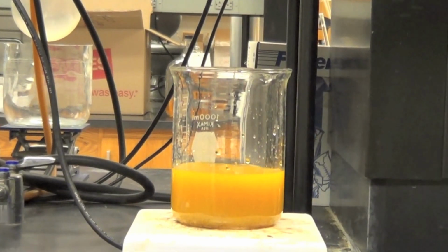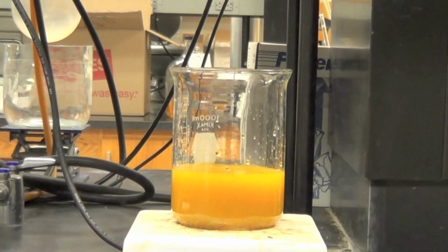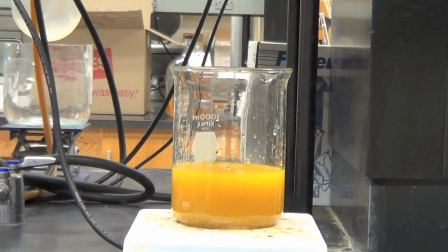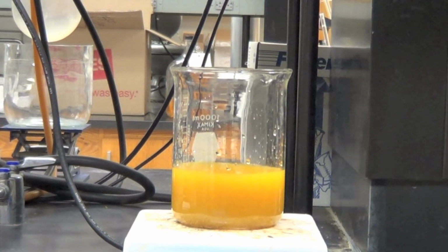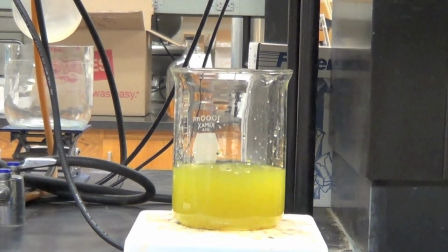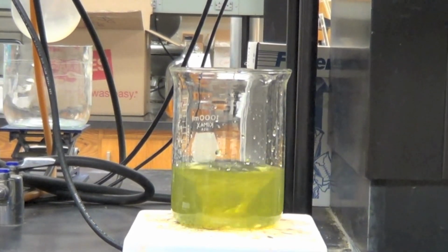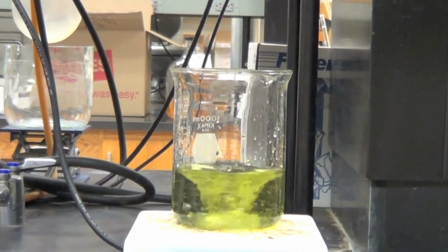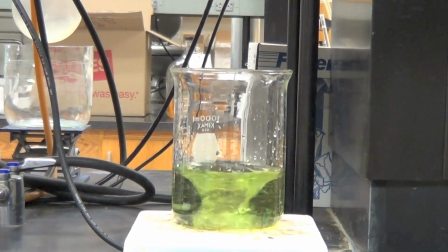Now, each color change corresponds to a specific concentration of the ions involved. As the cerium oscillates between its reduced state cerium-3 and its oxidized state cerium-4, the iron complex is also oscillating between its reduced state iron-2 and its oxidized state iron-3. Cerium-3 is clear, cerium-4 is yellow, the iron-2 complex is red, and the iron-3 complex is blue. Knowing this and some basic color theory, deriving the relative concentration of the ions at any point is a simple procedure.